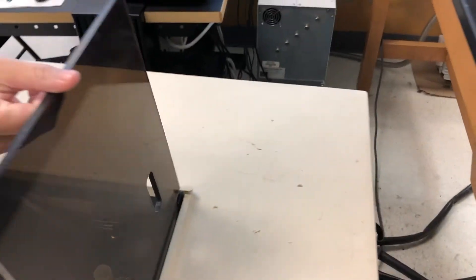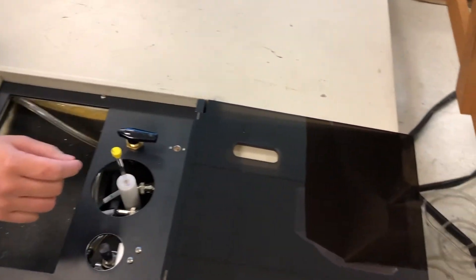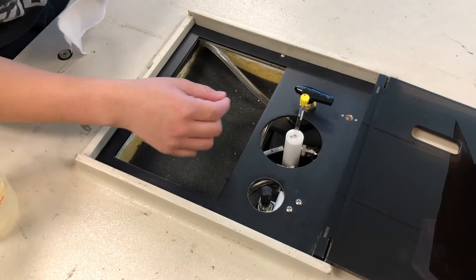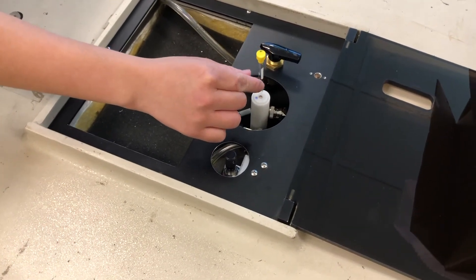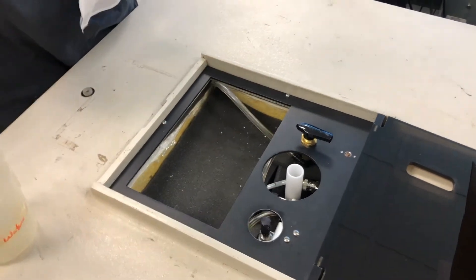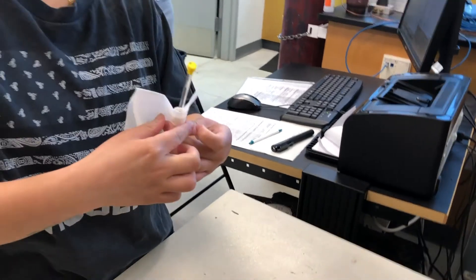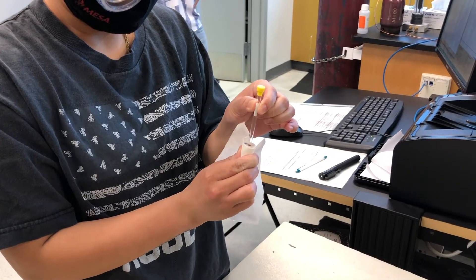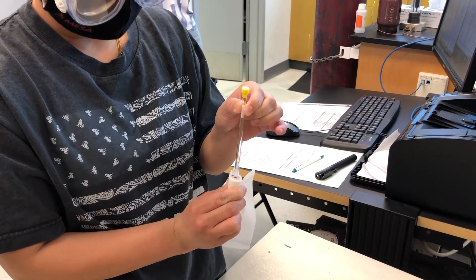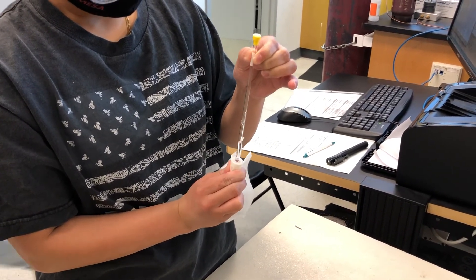When placing the tube into the machine, turn the knob 180 degrees until the sample tube pops out. Avoid touching any part of the tube that isn't white, and use a kimwipe to remove the sample holder. Place the sample tube aside in a container. Insert the tube into the bottom slot of the machine to adjust the white holder.